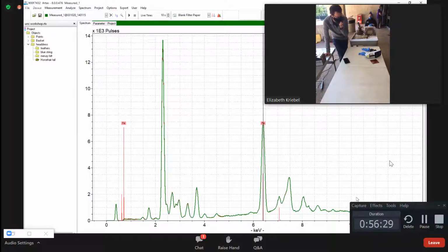But the good news is this is testable. You don't have to follow my advice on this. Measure a water bottle. If you measure a water bottle filled with water, the reflectance is going to pick up any contaminants that are on the surface of the XRF. So if any powderized arsenic made it onto the XRF window, you'd know right away from that measurement.